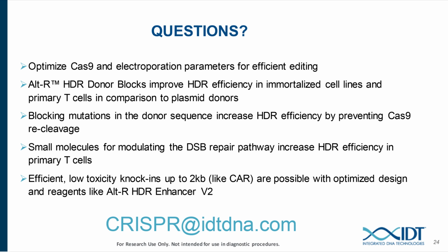Great. And kind of in a similar vein, how do modifications on HDR donors increase HDR rates?